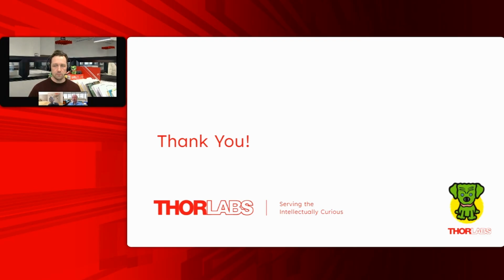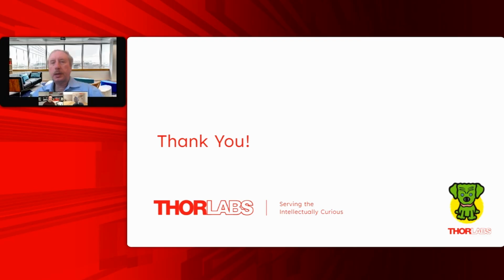Okay, yeah, sure. We use a quantum cascade laser as a continuous source, not a pulsed source. So basically, this is just a very bright source. And the limitation is the same as when you do regular spectroscopy with step scan spectroscopy. Your limit will be the response time of your detector, which is currently a few nanoseconds. But you get obviously better signal to noise because you use a brighter source on the microscope. Still, your limit will be the response time of your detector.